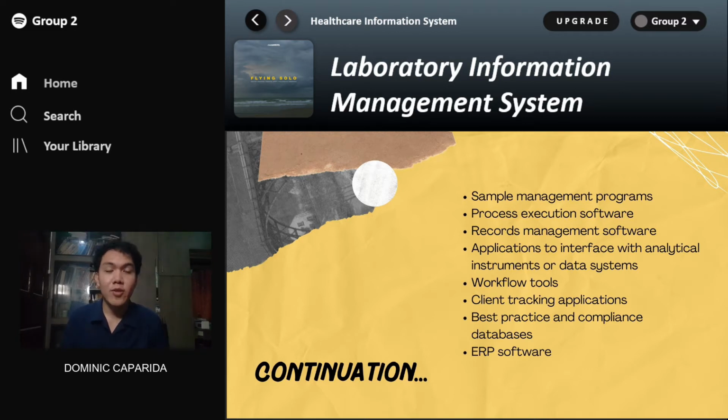Next is records management software. These are software that mainly focus on the records or documents. It talks about how well they store or manage properly the documents or records that belong to the patients. Next is application to interface with analytical instruments or data systems.